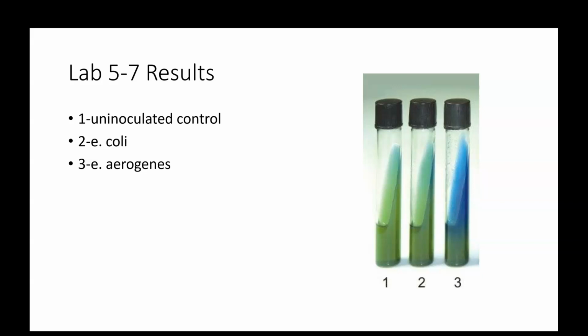It should tell you what no result looks like, and therefore it's a type of negative control. It also tells us that our media is sterile and that we don't have a reaction in the absence of a positive bacteria. And it also tells us that our pH indicator doesn't just spontaneously turn color after incubation at 37 degrees, for example.